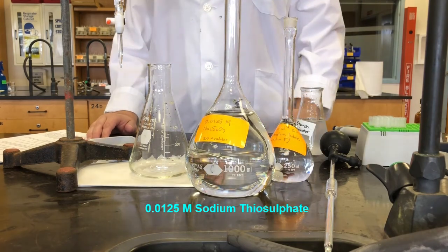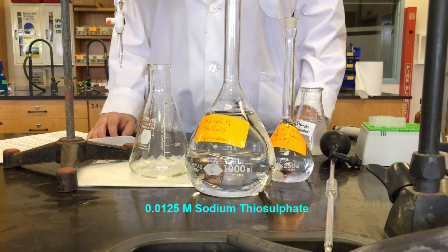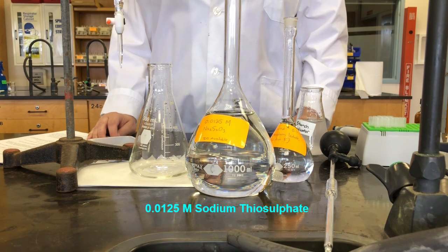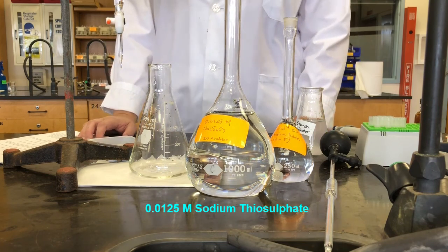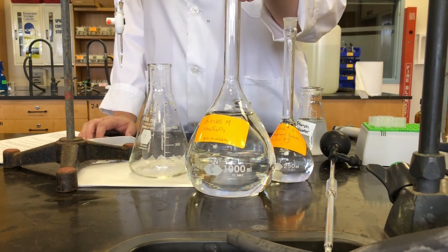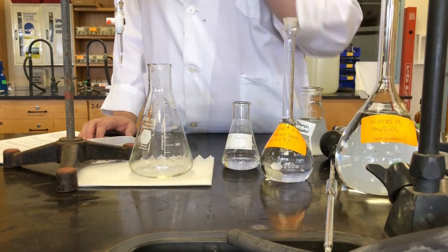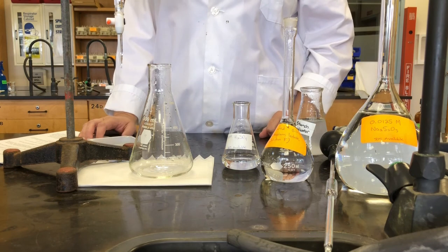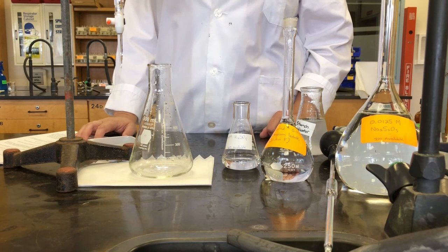Okay, so with solution C, we've diluted down to 0.0125 molar. So we know that's its approximate concentration because I took 125 milliliters of the stock solution C and I diluted that down into a 1 liter volumetric flask. So it is approximately 0.0125 molar. Okay, so I've used this solution to fill my burette. So that solution is in our burette right now, ready to go. Okay, so we're going to standardize that to determine its exact concentration.